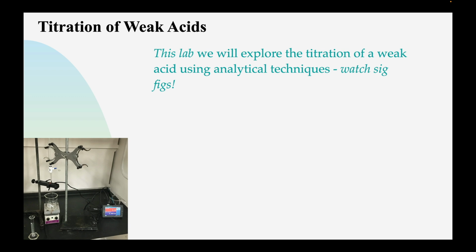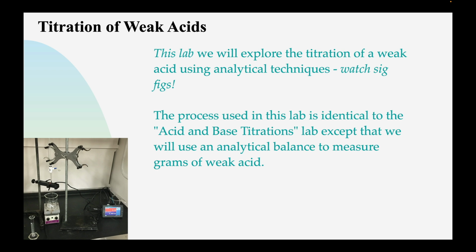We'll use the analytical balances and the burette's full capabilities, so make sure that you watch sig figs in this lab. That'll be pretty important. The process is going to be the same, so I would bring along the instructions from the acid and base titration lab. That'll help you get all the equipment set up, and so you'll know what to do. And like in the other lab, once you get everything set up, things go pretty fast.